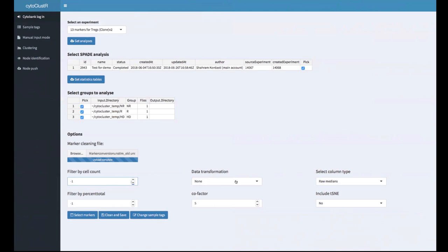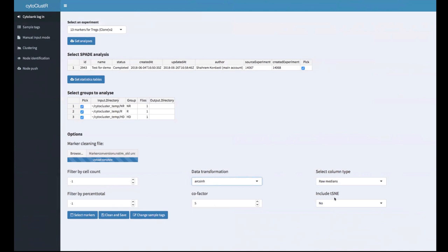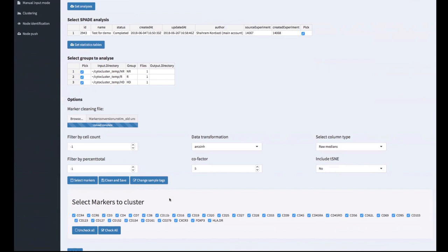When performing the heat map and hierarchical clustering, we want to transform our data so numerical values are stable around zero. For that, we use the arcsinh transformation with a cofactor of five, which is particular for this experiment. We select the raw medians from our SPADE experiment and don't include viSNE columns for this analysis. By pressing 'select markers,' Cytocluster reads the expression of all markers for each group and presents all the markers you can cluster on.